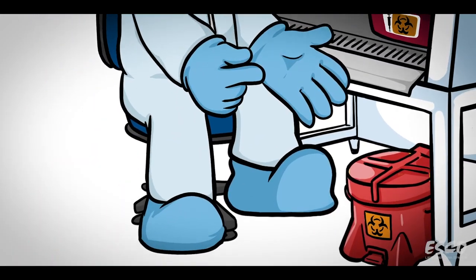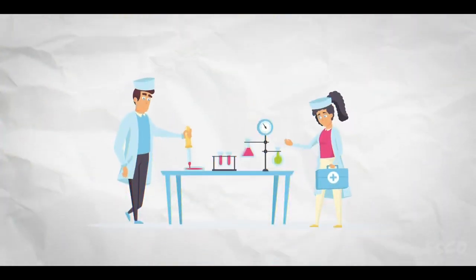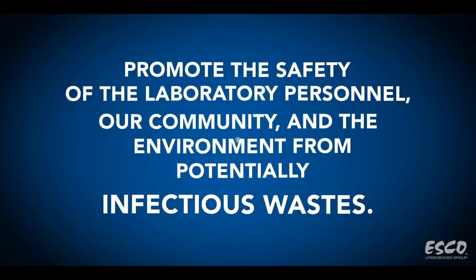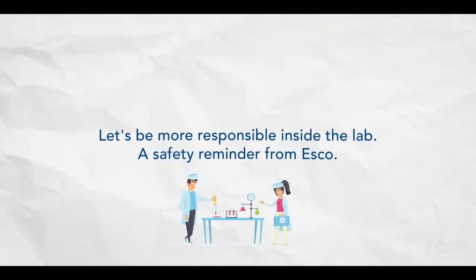gloves in a separate container along with the solid, non-pathogenic wastes. Promote safety in the laboratory, in our community, and the environment from potentially infectious wastes. Let's be more responsible in the lab.